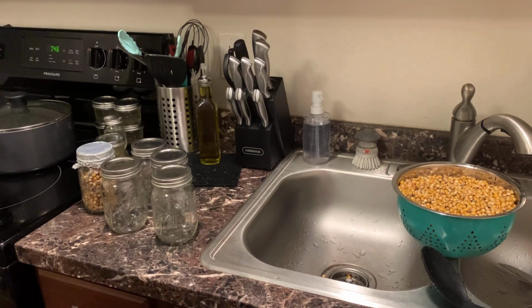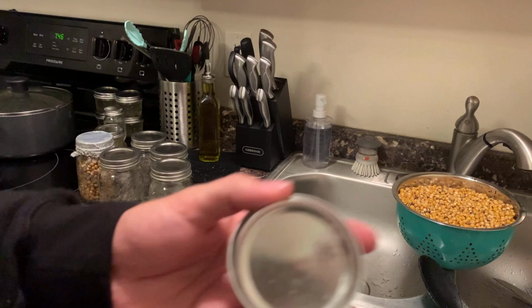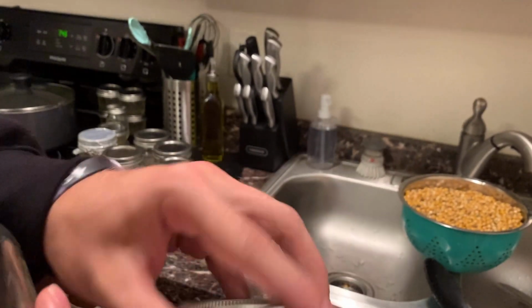All right, so now we're gonna be filling up our spawn jars. So what you need to do, your mason jars are gonna come with that lid on top. You just turn it upside down.